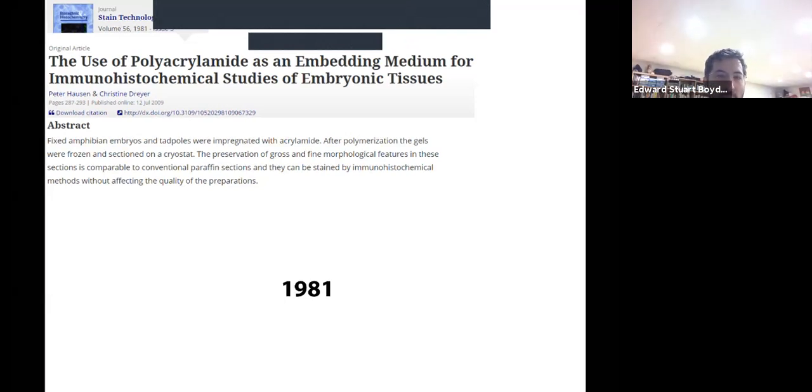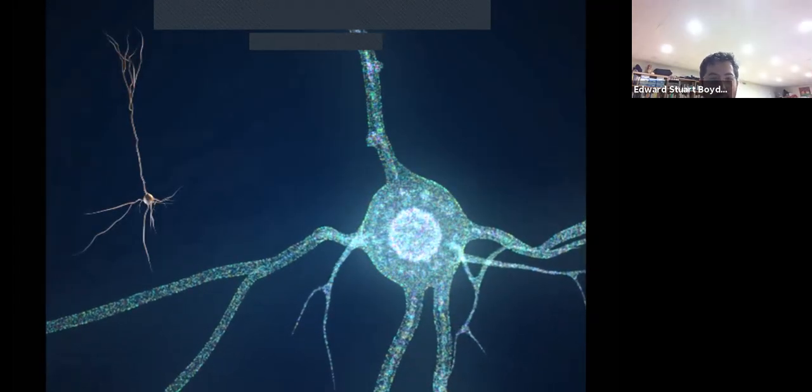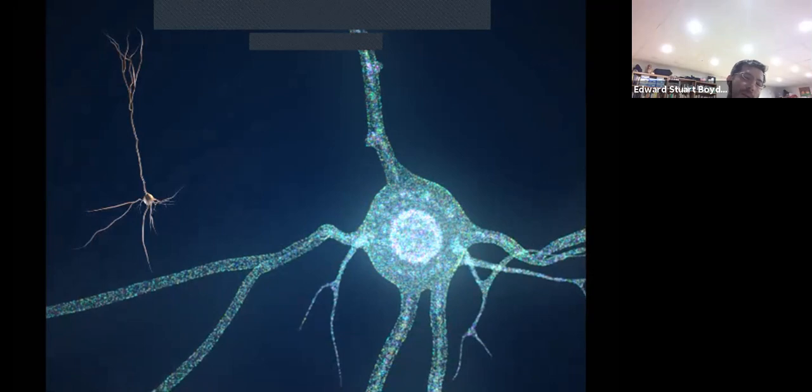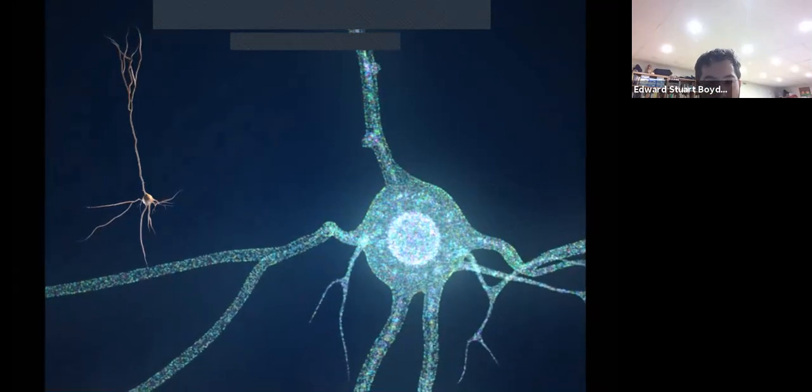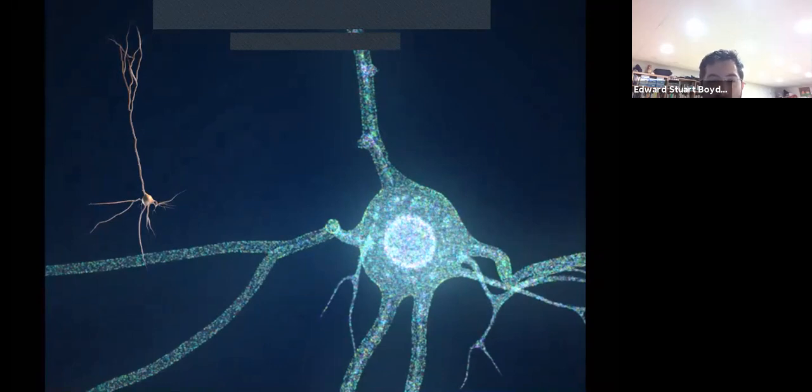So if you do it just right, maybe you could make a chemical mesh that's very dense and very even, and turn a cell, like the one on the left, to something like on the right, a constellation of biomolecules hovering in space. Two biomolecules that are touching will now be some minimum distance apart. And two biomolecules that are some distance apart will now be scaled up by some linear factor.